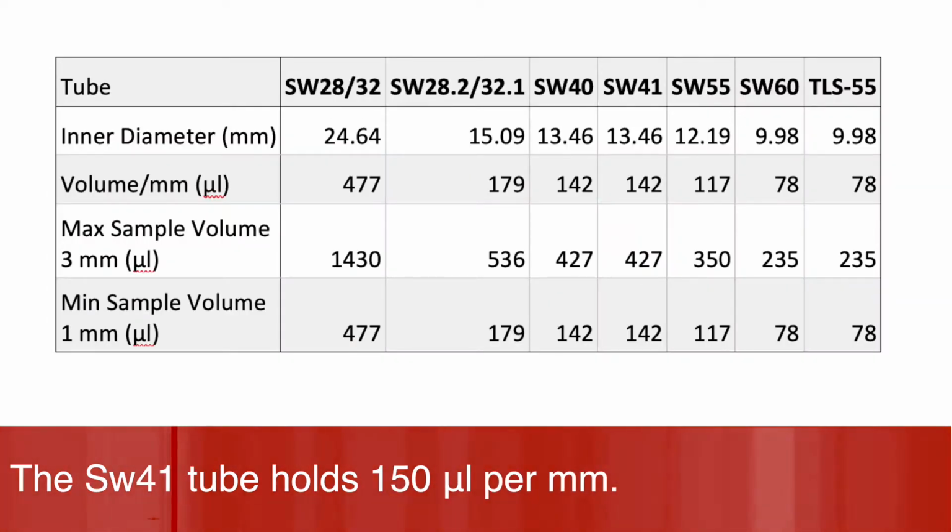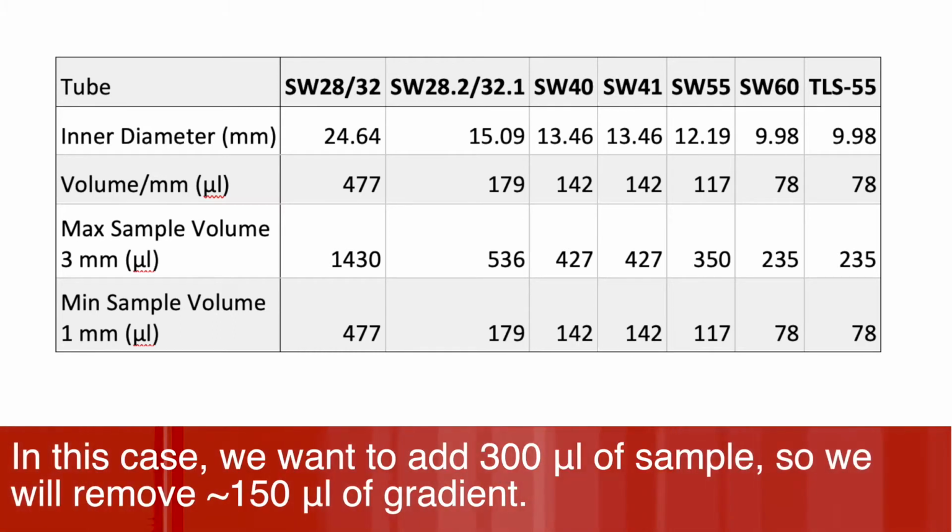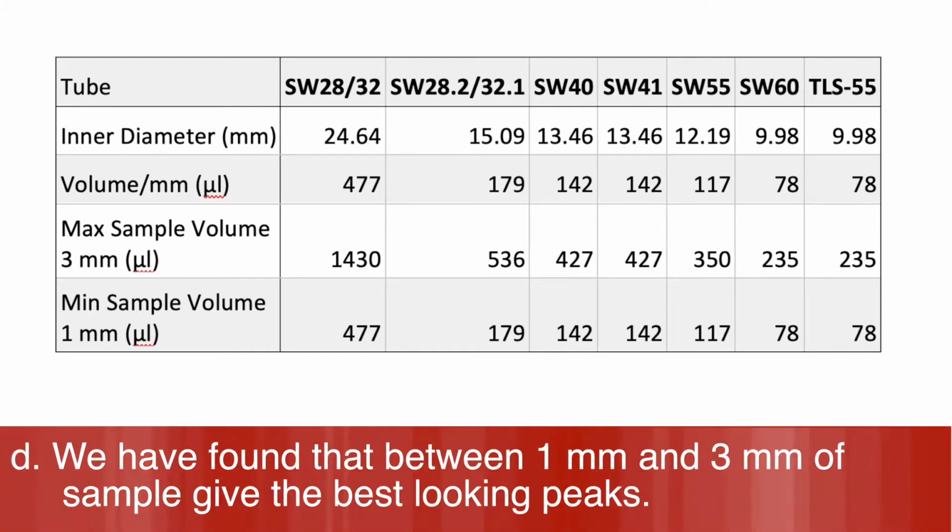The SW41 tube holds 150 microliters per millimeter. In this case, we want to add 300 microliters of sample, so we will remove approximately 150 microliters of gradient. We have found that between 1 millimeter and 3 millimeters of sample give the best looking peaks.